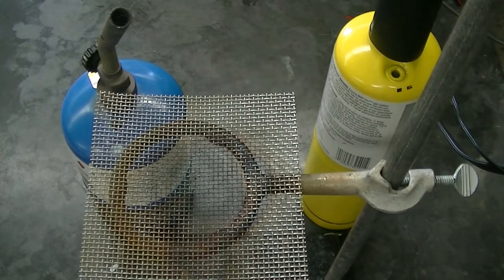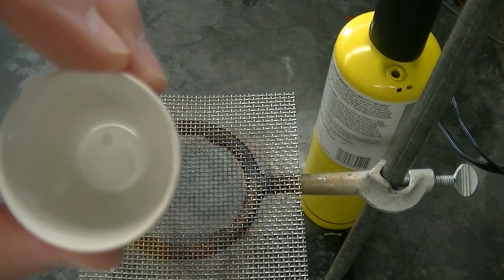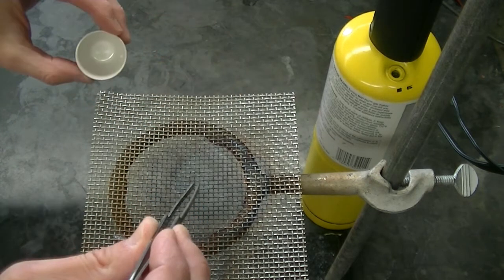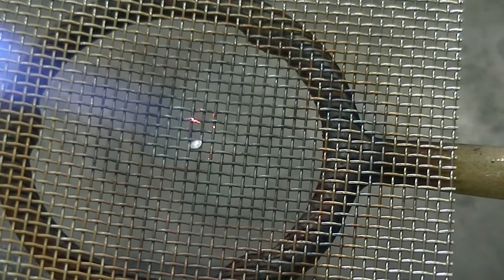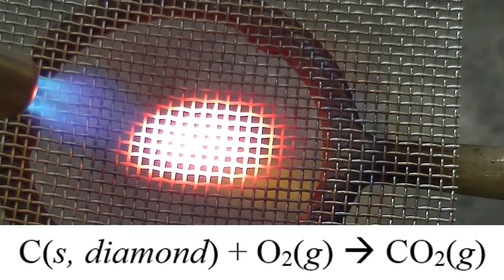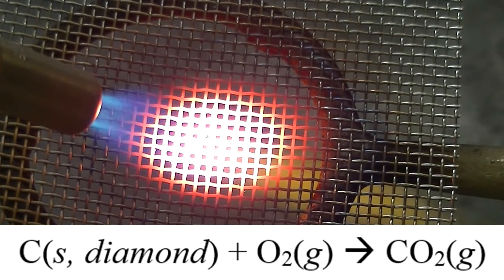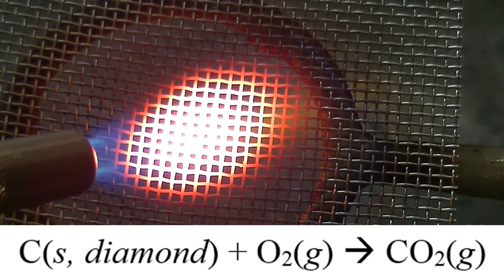I'm going to try burning the diamond again, but this time I'm going to use MAP gas instead of propane. I'm also going to place the diamond on this screen to allow for a better flow of oxygen to the diamond as it burns. The screen should allow oxygen to get to the diamond better, which should allow the diamond to get converted to carbon dioxide easier. The MAP torch burns at a higher temperature, and this should also allow for a greater conversion to carbon dioxide. Altogether, I spent about 5 minutes heating the diamond on the screen with the MAP torch.